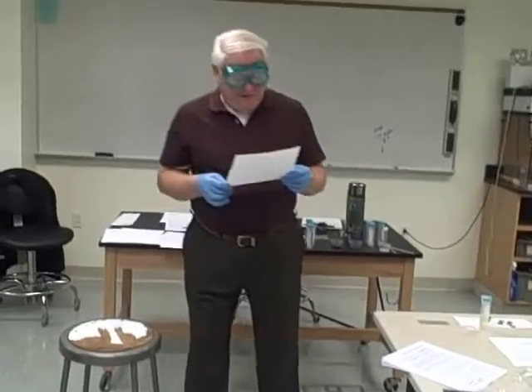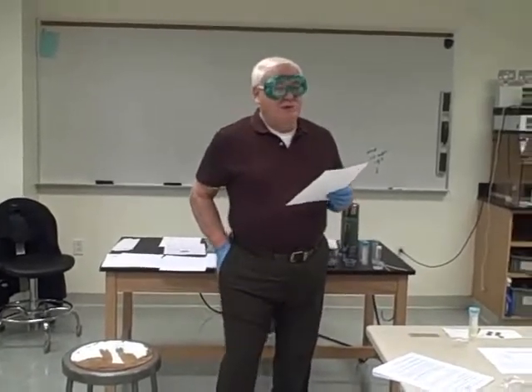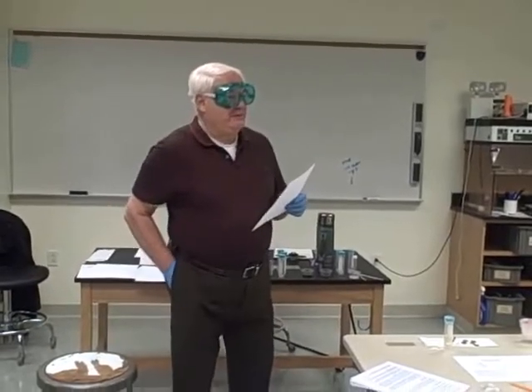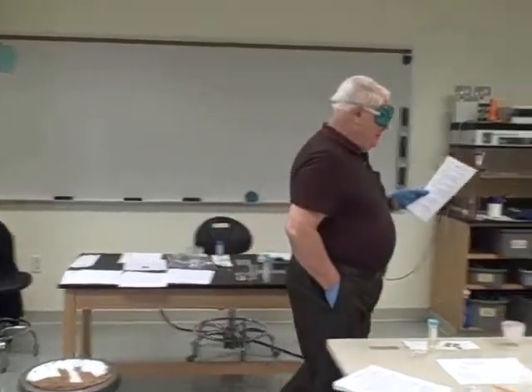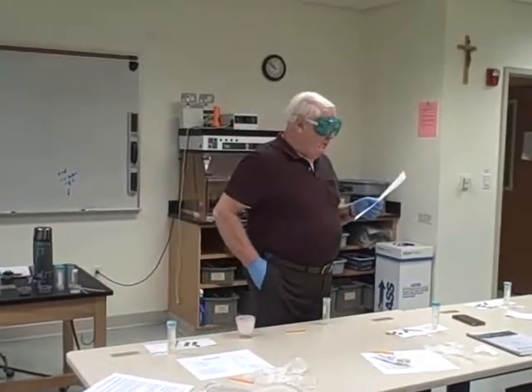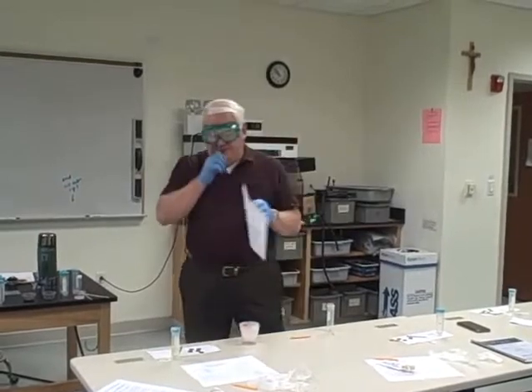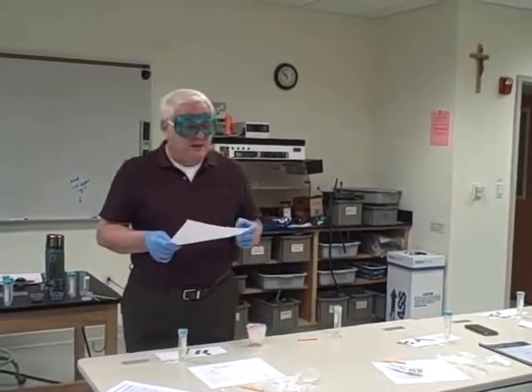Okay. The next experiment, number 4, is kind of an interesting one. I think this is Sharmila's favorite. It's using reactivity to predict where metals are going to be found in nature. And I'm using my cheat sheet, of course.